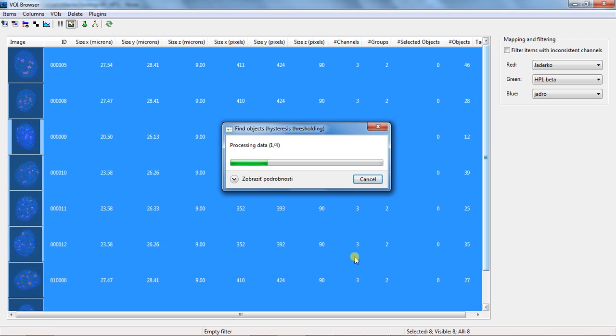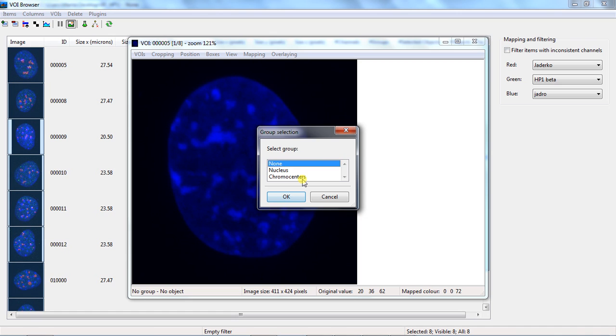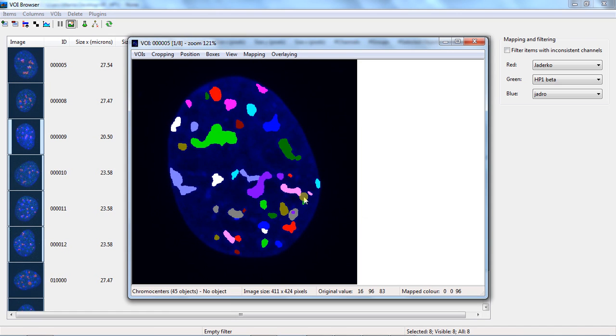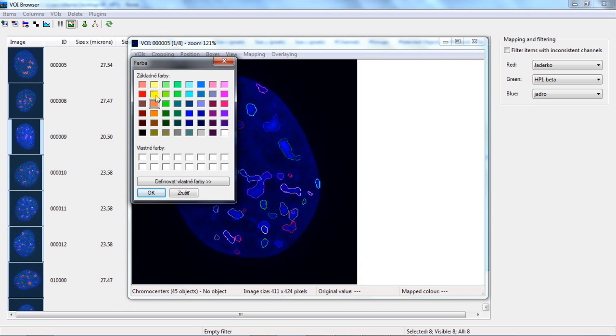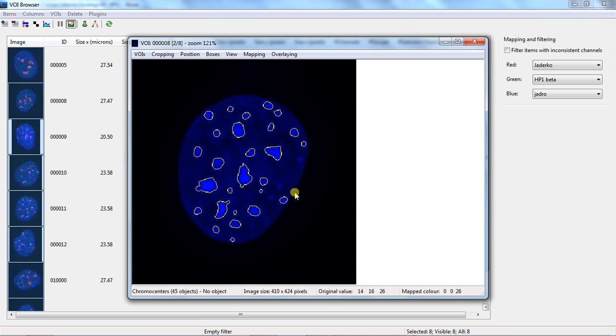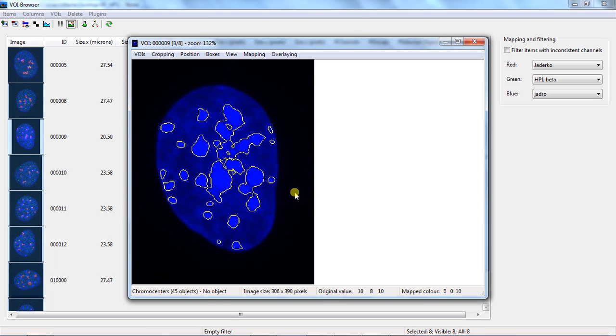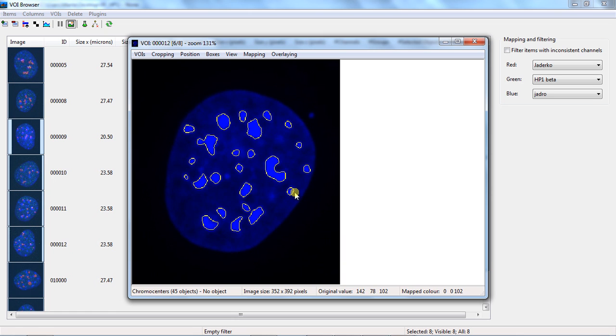Former information of the 4 images will be replaced with the new ones. Look at the output now. It is definitely much better. We will keep it that way.